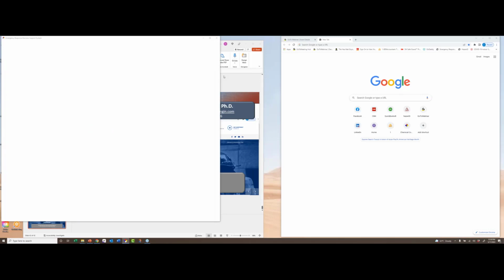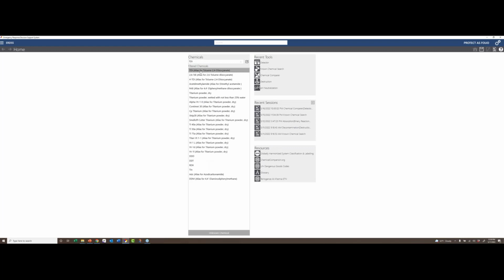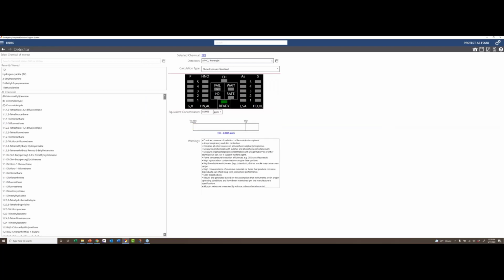Some of that's the proprietary nature of how we do it, so I don't want to go into tons of that. Hopefully you can understand some of the nature of it. It's a function of the device and the results that you get. Each detector has some variability, so not every detector has the same response. So we have to learn the device in order for it to occur. That's some of the proprietary nature of how we do it. But the main thing is each response is unique and specific to that element.